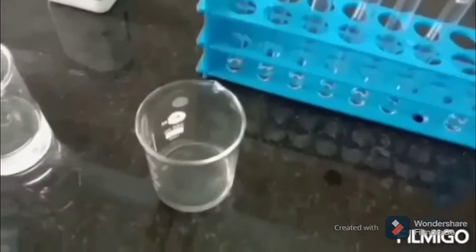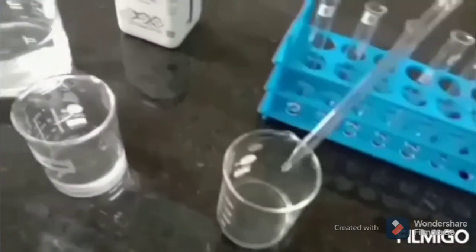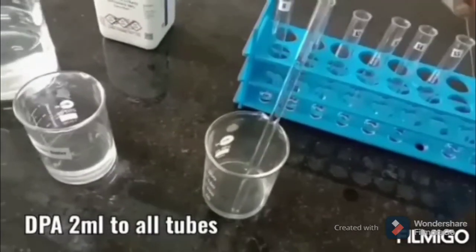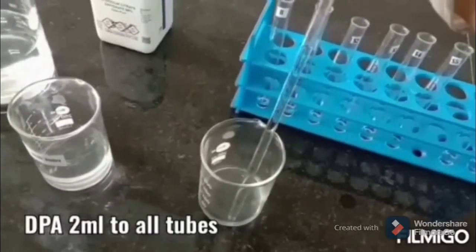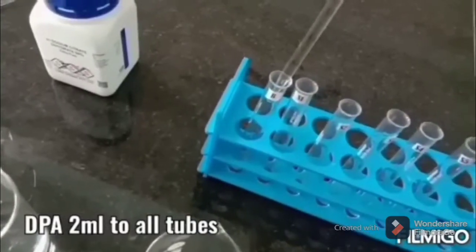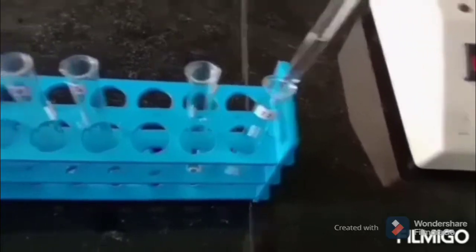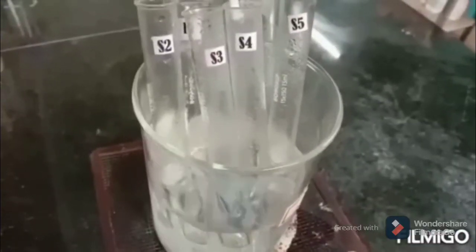Now 2 ml of DPA reagent is added to all tubes including blank, all standards, and T1, T2. This makes a total volume of 4 ml in all test tubes. This is mixed well and kept in boiling water bath for 10 minutes.